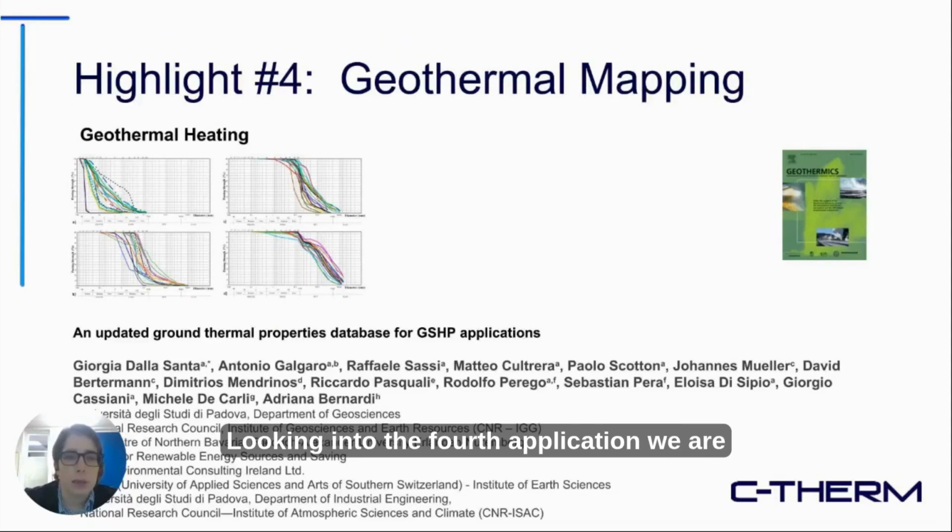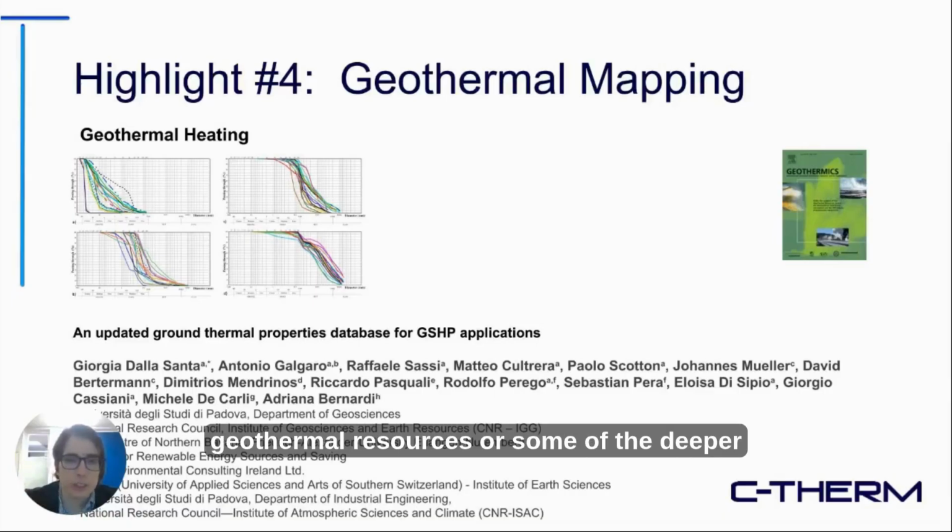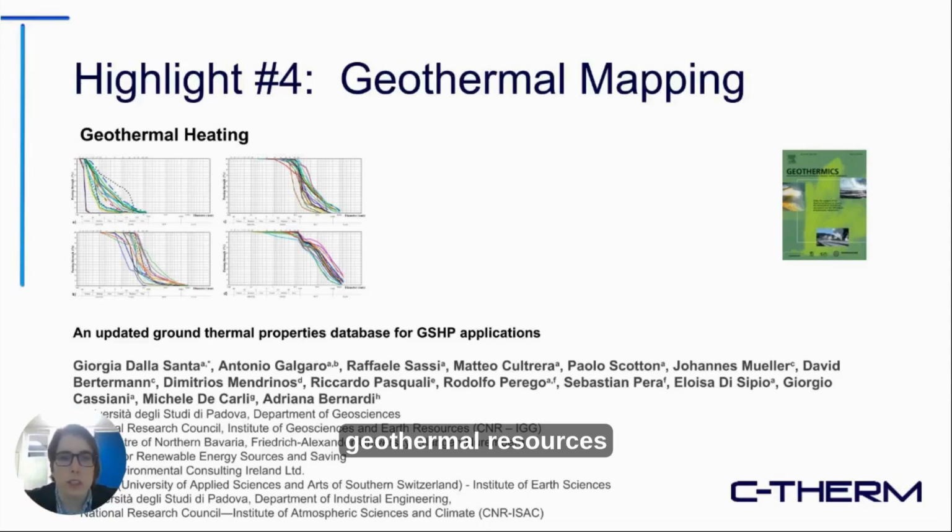Looking into the fourth application, we are looking at geothermal mapping. So a very common application for thermal conductivity measurements in geological systems is looking at geothermal heating technologies, whether it's the near surface geothermal resources, or some of the deeper geothermal resources that can be exploited.